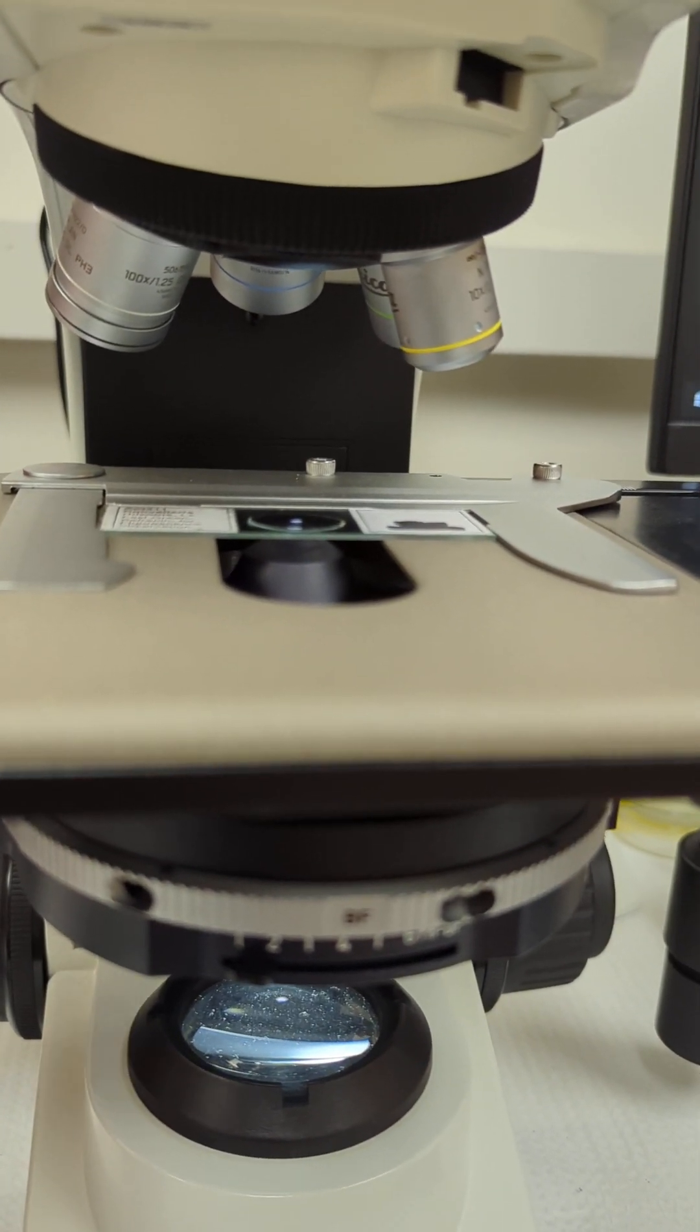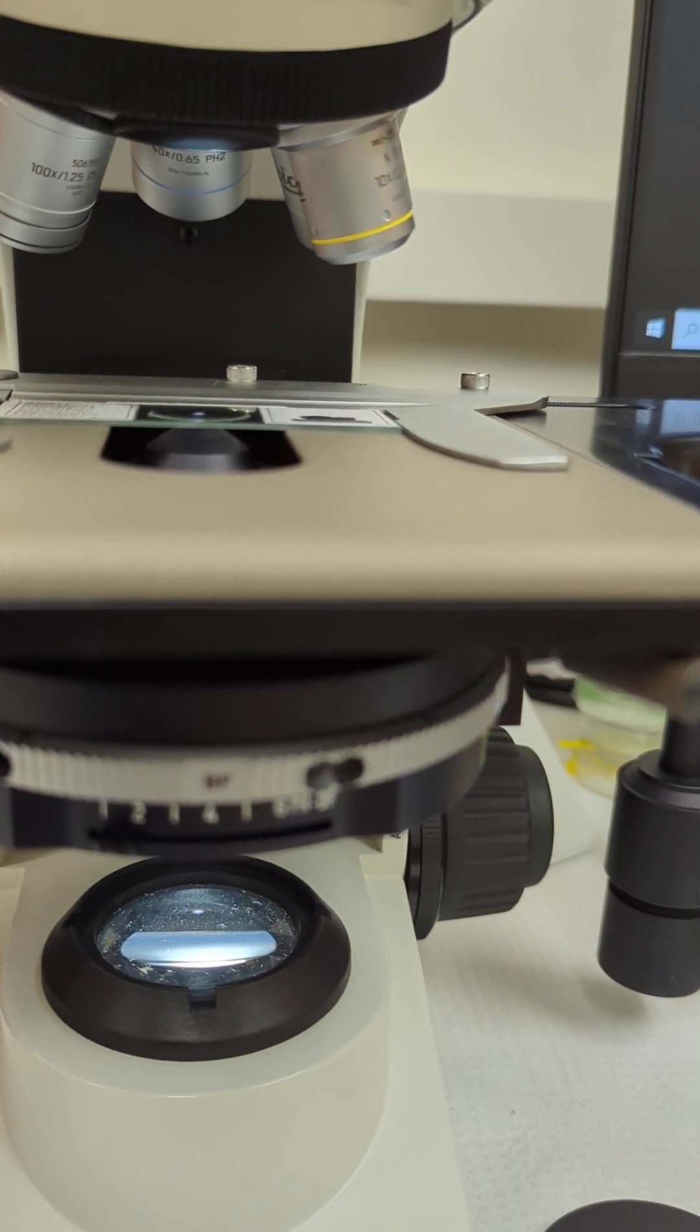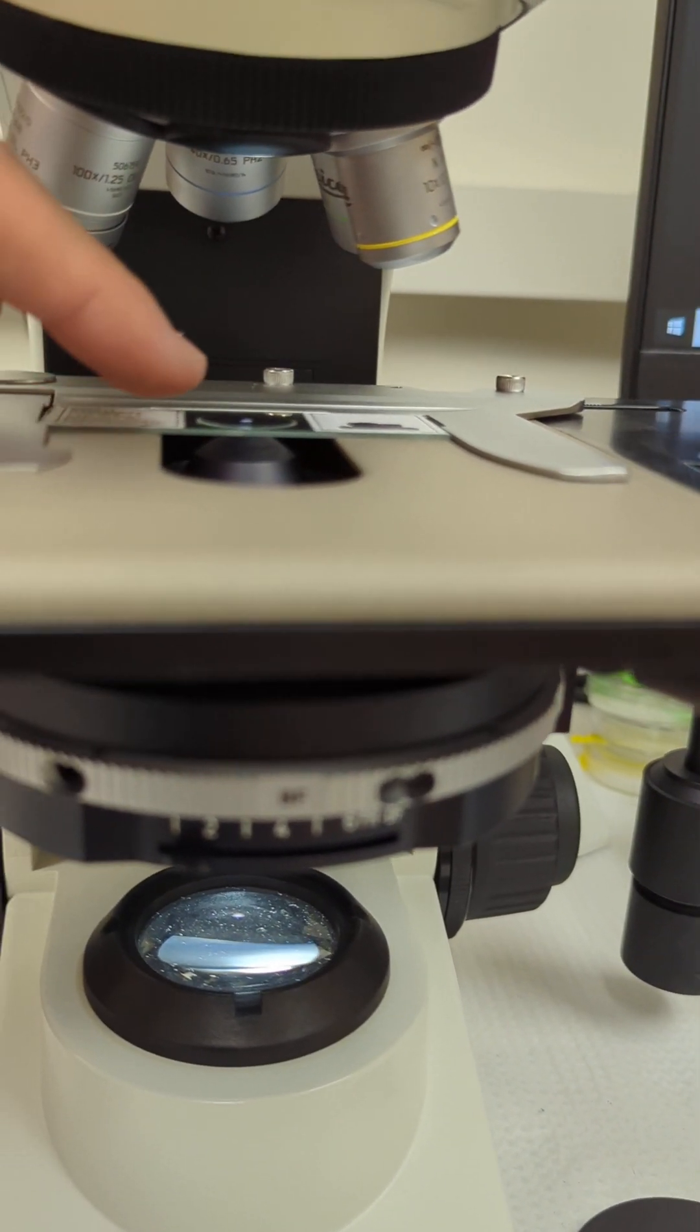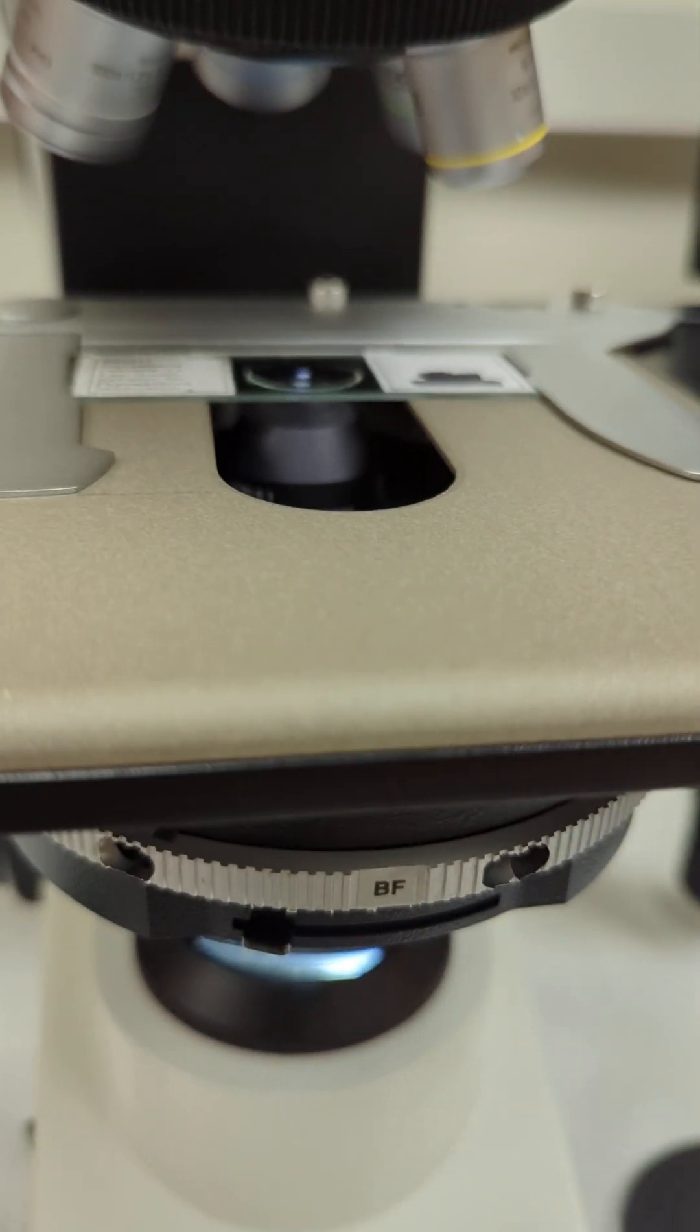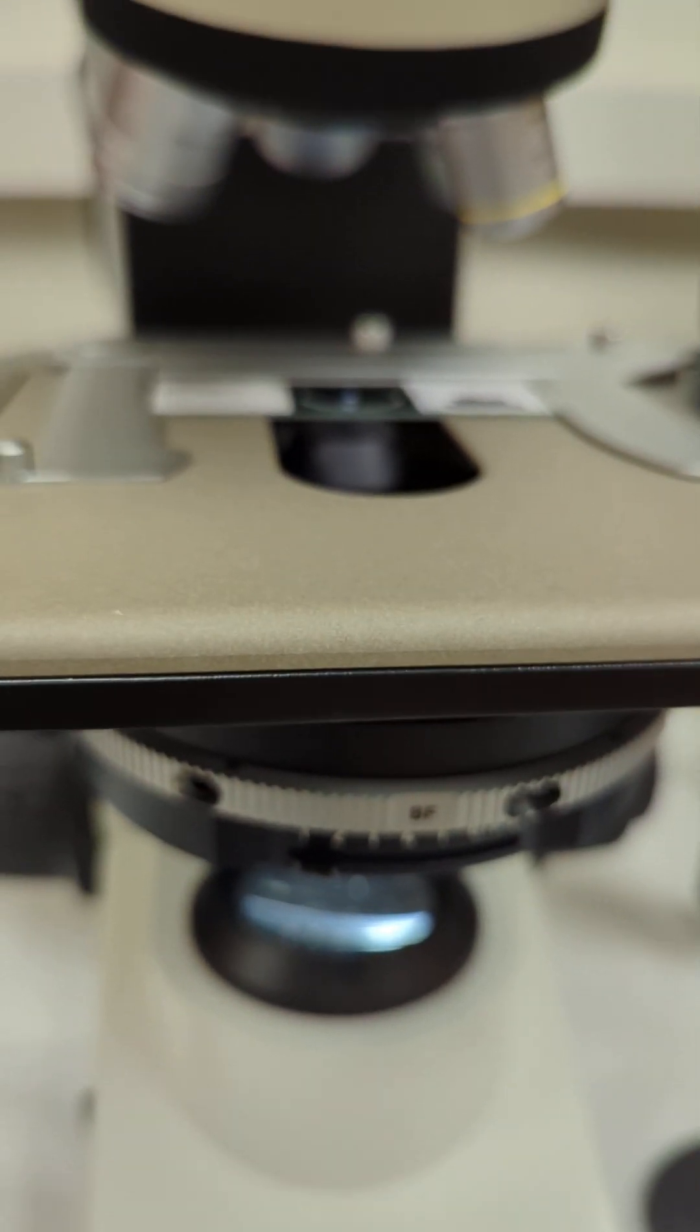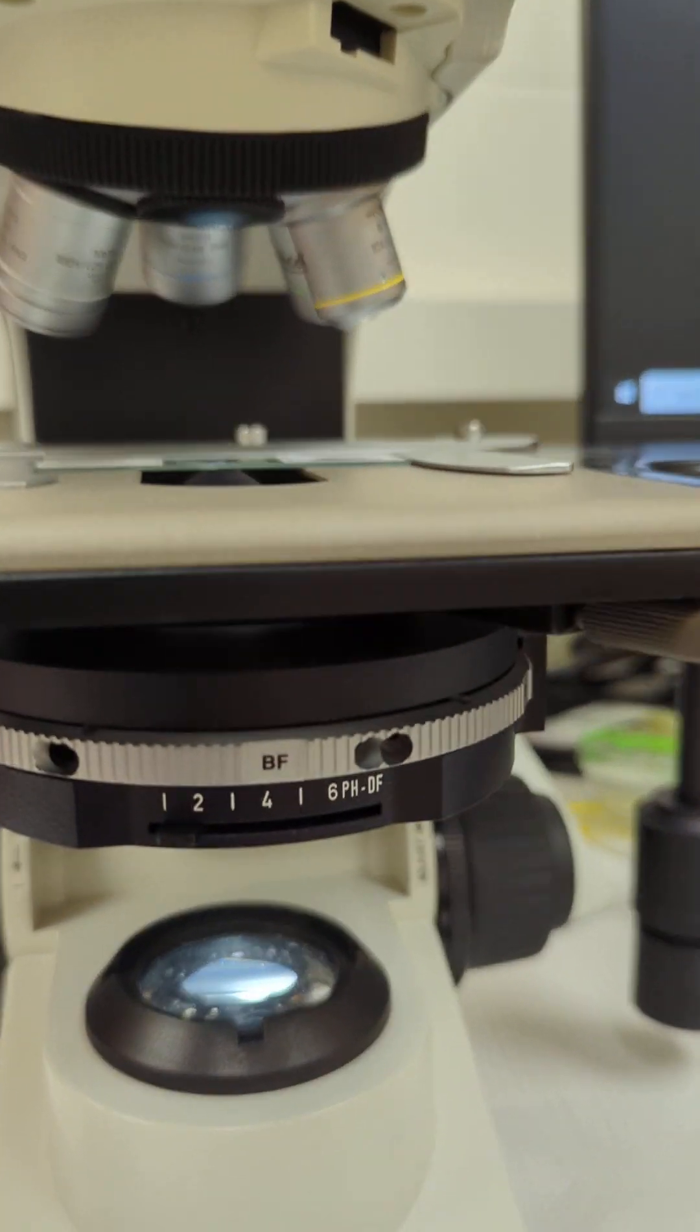Wipe off your lens back here with lens tissue, but lens tissue only. Optical grade lens paper touches that lens. Then clean off your slide. Make sure the oil droplet is completely off of there, and you can clean off any smudging so you can see clearly again.